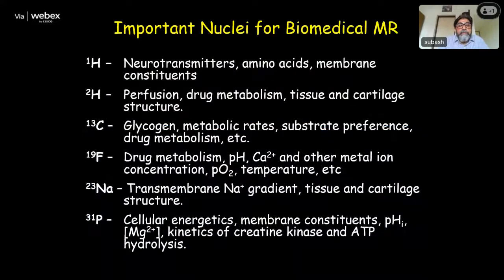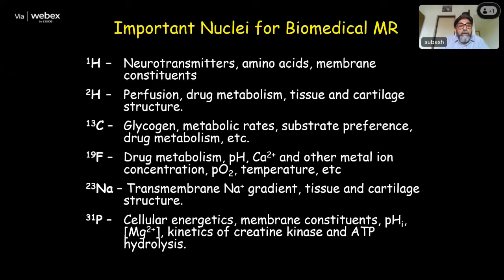So these are the nuclei which we discussed. The only thing I want to tell you is that in fluorine-19 you can also do calcium ion concentration and other metal ion concentrations. You can do the temperature measurement and also partial oxygen pressure.